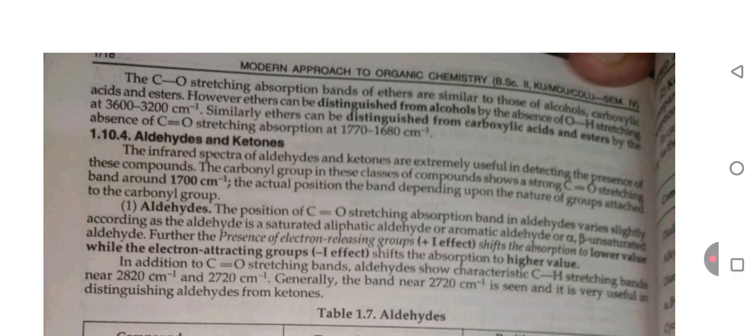Aldehyde and ketone. The infrared spectra of aldehyde and ketone are extremely useful in determining the presence of these compounds. The carbonyl group in these classes of compounds shows a strong carbon double bond oxygen stretching band around 1700 cm inverse. The actual position of the band depends upon the nature of the group attached to the carbonyl group.